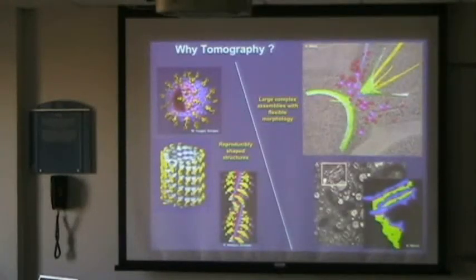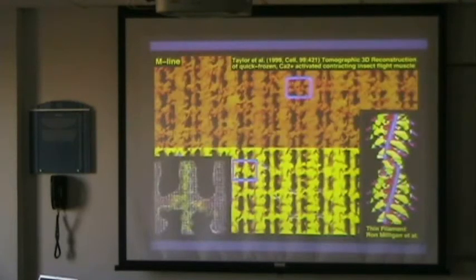So the good thing, as I said before, the reason why tomography is becoming more and more important is that tomography is not based on averaging. All these kinds of reconstructions have an averaging component in there, which you may or may not have directly under control, actually. You always think you have it under control, but you may not. Now, this is not the case with tomography.